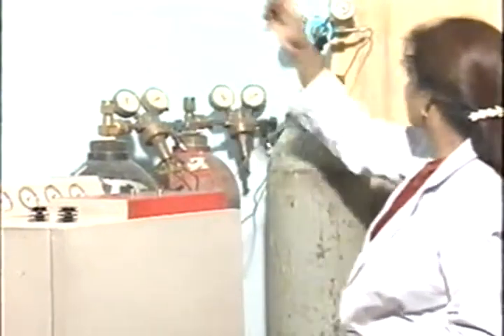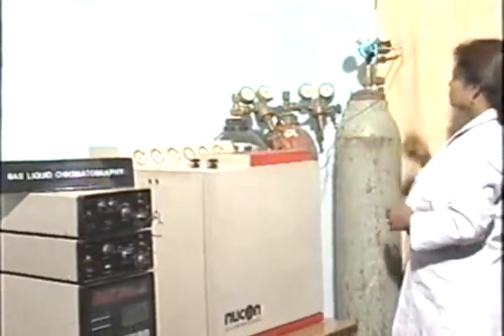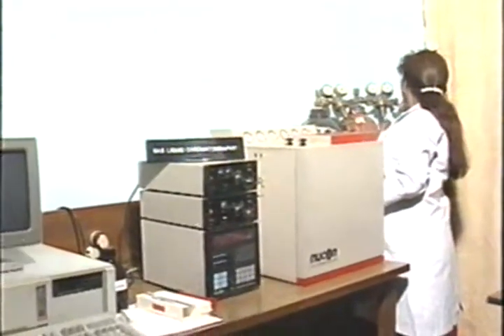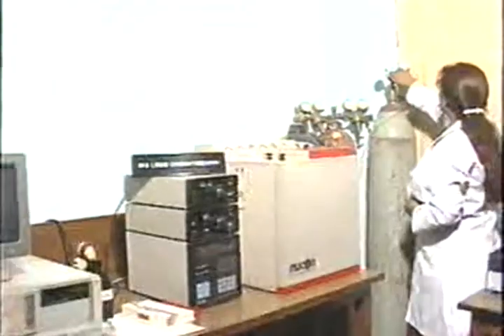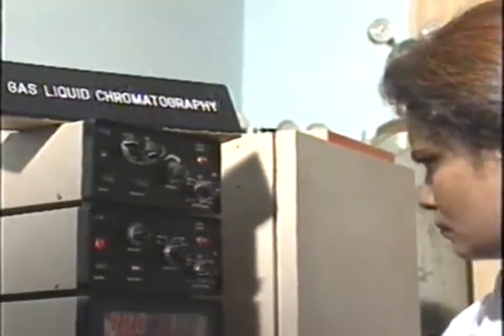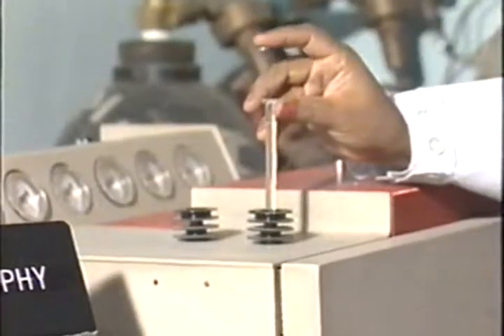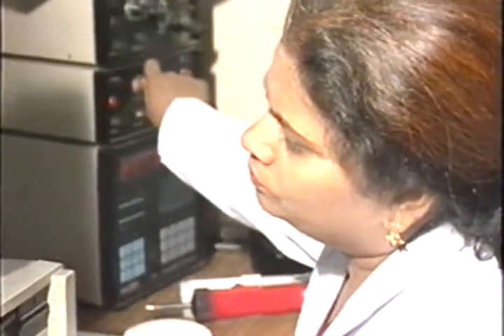Gas-liquid chromatography is used for the separation of volatile compounds present in the drug as well as in vehicles used in preparation of homeopathic drugs. Here, mobile phase is a gas which carries the ingredients in the vaporized state over the stationary phase, which is packed in long steel or glass columns or even several meters long steel capillary columns. Mixture of compounds gets separated when they move in these columns depending upon the retention period. Component parts are identified qualitatively with the retention time and quantitatively by the area of the peak.